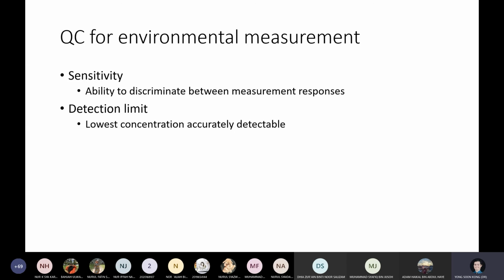To measure how good your instrument is. Now, I would define sensitivity as how small a response an instrument can measure or detect. Some instruments are not that sensitive, and if you have a very low level of contamination and use that instrument, it possibly won't pick up anything. They just report "not detected."